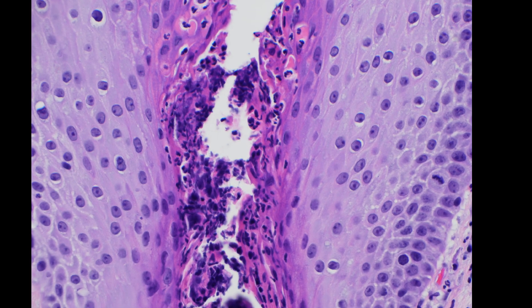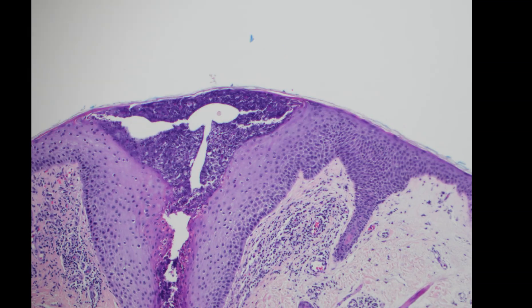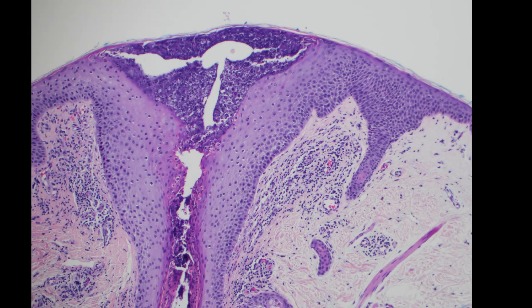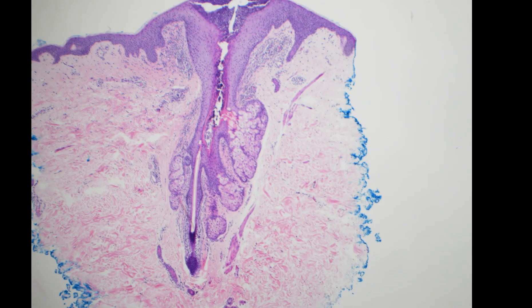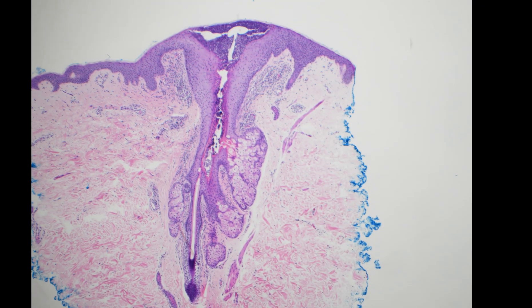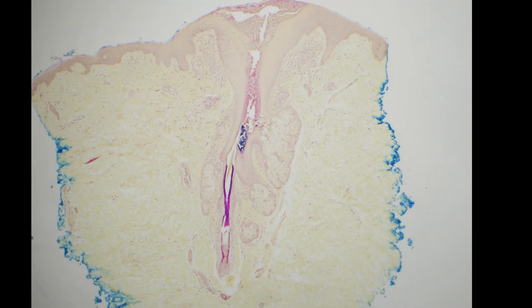There are some other less common causes of folliculitis, but this is bacterial folliculitis forming pus, and I thought it was a really nice example because it's only occasionally that we get a perfect cut through the hair follicle like this where you can see the entire thing. And for teaching purposes, I wanted to highlight the bacteria and show you a little bit better. And look at that — this is a gram stain.